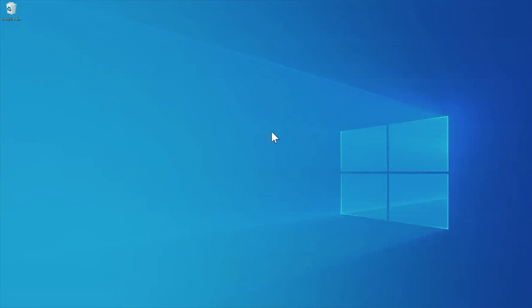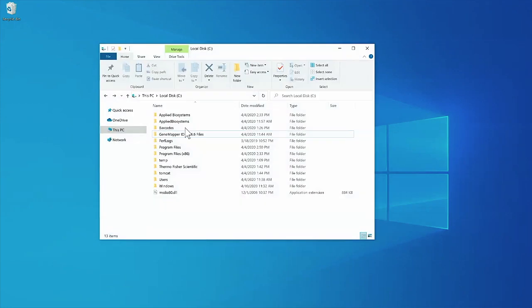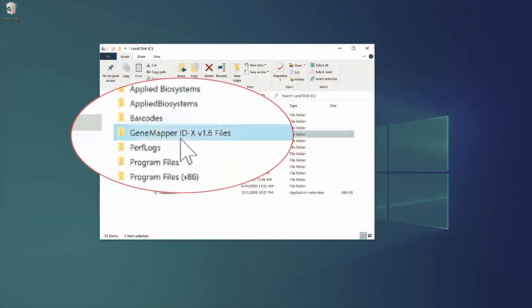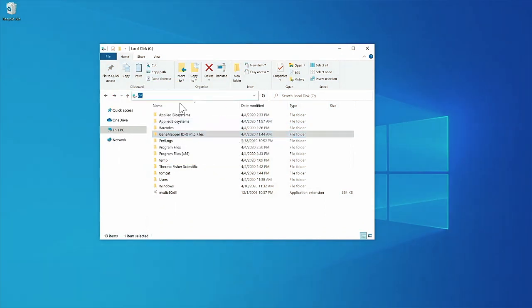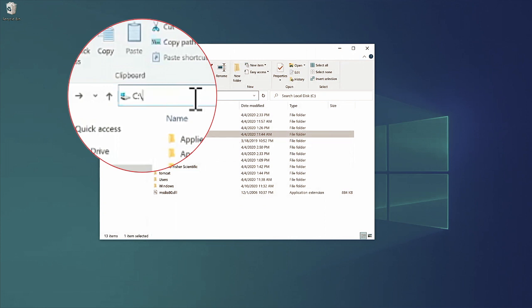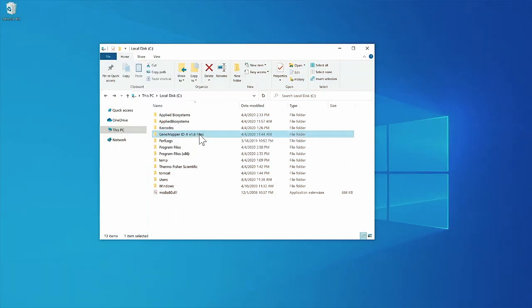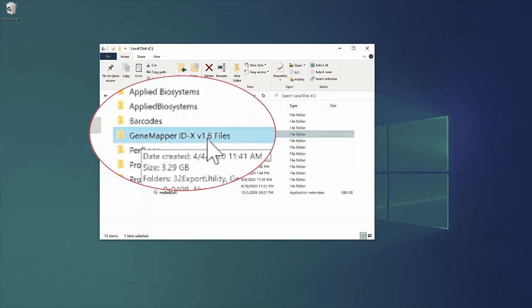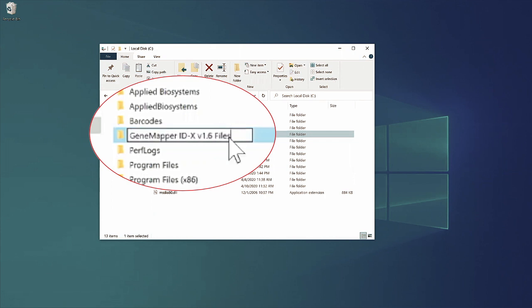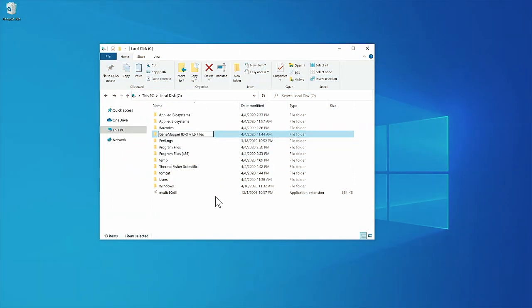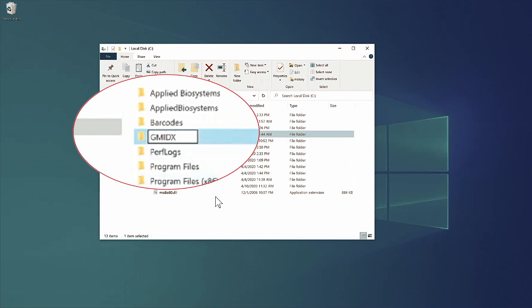So here we are on the Windows desktop. I have just downloaded the GeneMapper IDX software files. I've placed this folder — GeneMapper IDX v1.6 files — on the root drive, or C drive, of my laptop. You'll notice this file name has spaces and a period, which might not be acceptable for the installation to run. The best thing to do is rename this installation folder to something as simple as possible — I like to use GMIDX.